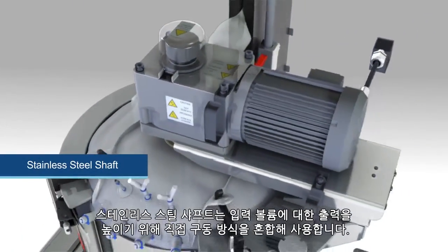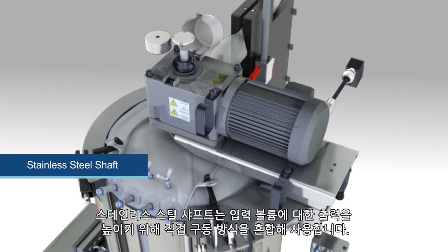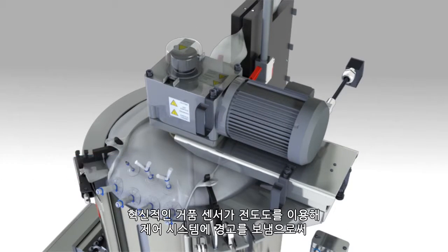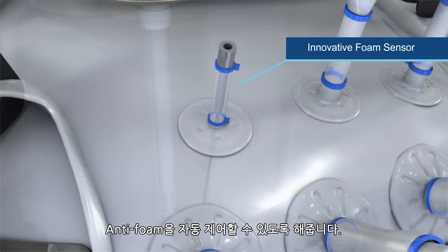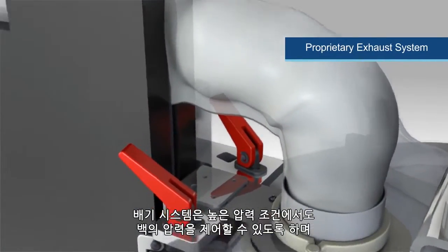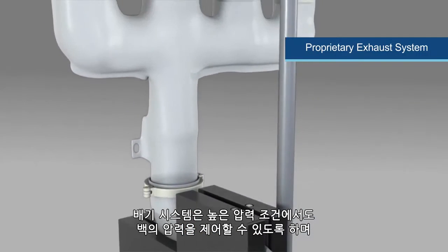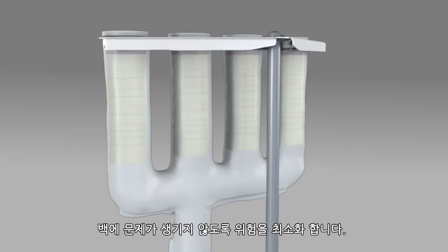The stainless steel shaft utilizes direct drive mixing for increased power-to-input volume. An innovative foam sensor uses conductivity to alert your control system, offering automated control of anti-foam addition. A proprietary exhaust management system enables high gas flow requirements to prevent bag pressure and helps minimize the risk of bag failure.